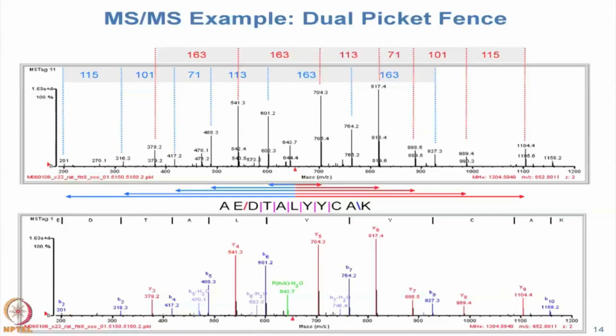Now, what information content is present in this? First of all, whenever I show you these things, there are several things you should know. This is the file name, which means nothing to you, but it tells me what project the spectrum came from. This little red caret is the position of the precursor mass in the MSMS spectrum. Over here is the parent mass, which is singly charged. Here's the precursor mass, M over Z, and then the precursor charge state is listed as Z.